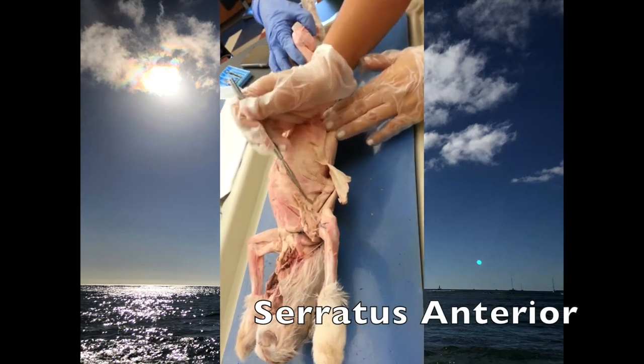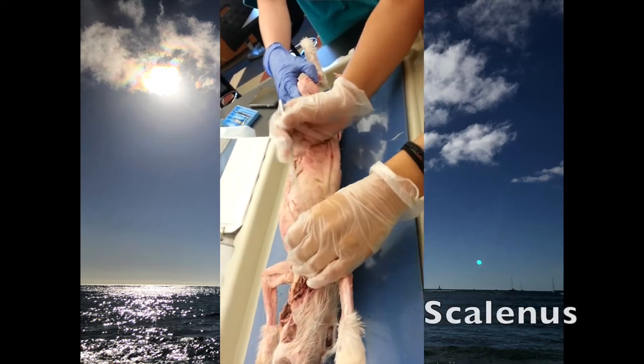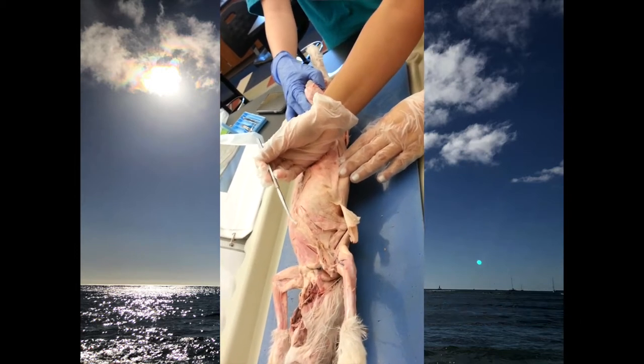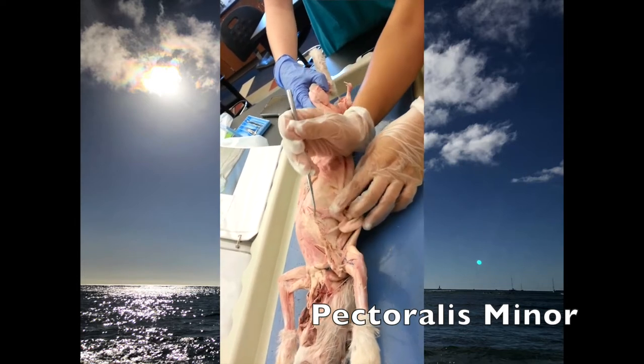This is the serratus anterior, where it's like the fan — you can see it right there. The scalenus is under the pectoralis minor, and if you pull back the fan, you can see the ribs.